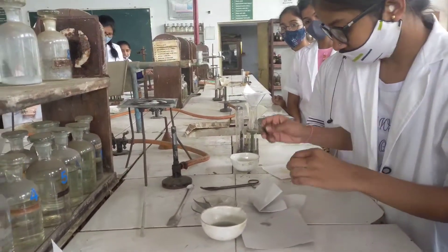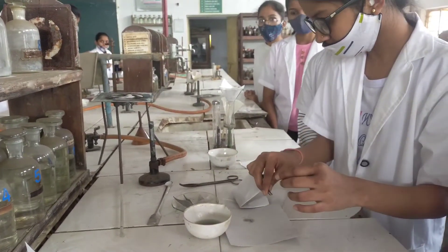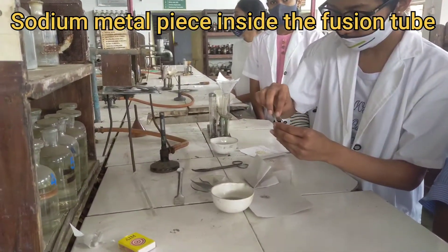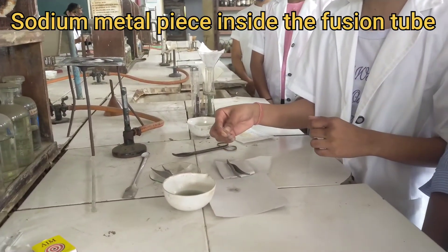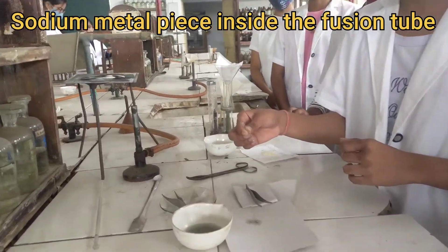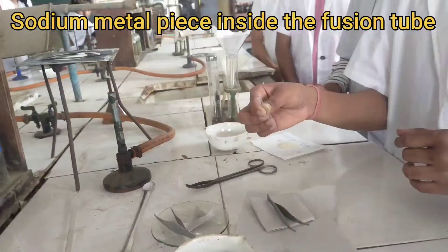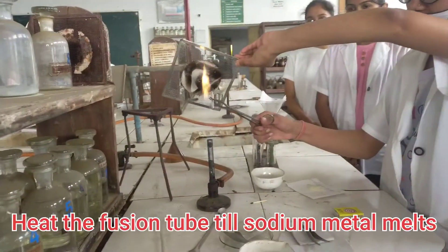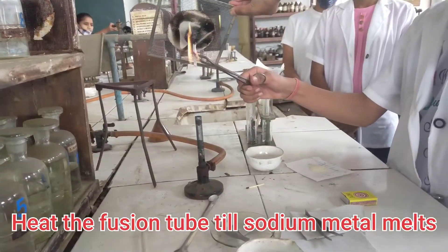Take a clean and dry fusion tube. Inside this fusion tube, take our sodium metal piece. We have taken the sodium metal piece inside this fusion tube. Now, heat this fusion tube so that the sodium metal gets melted.